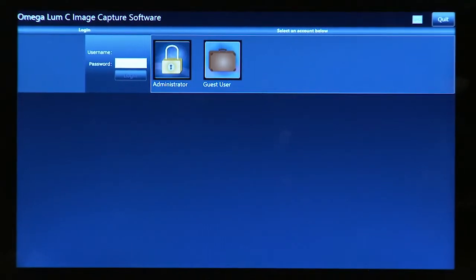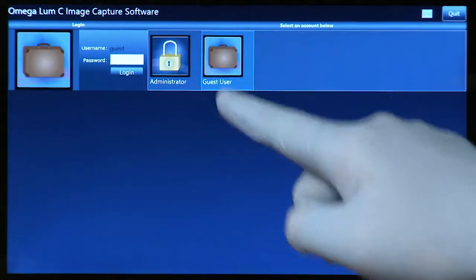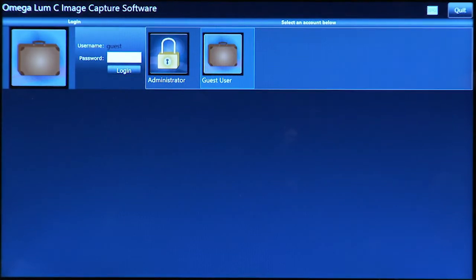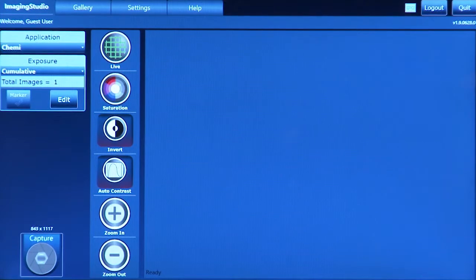You can set up different user accounts for different labs, or for different members of a single lab, however you'd like. Each user account can have unique protocols corresponding to their particular applications. Once you've selected your user account, you can start imaging.